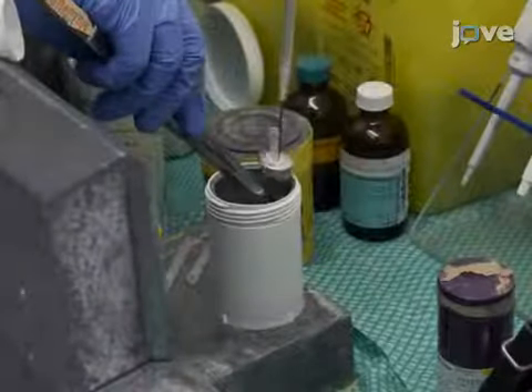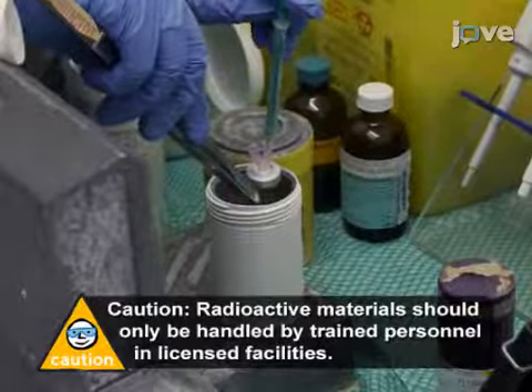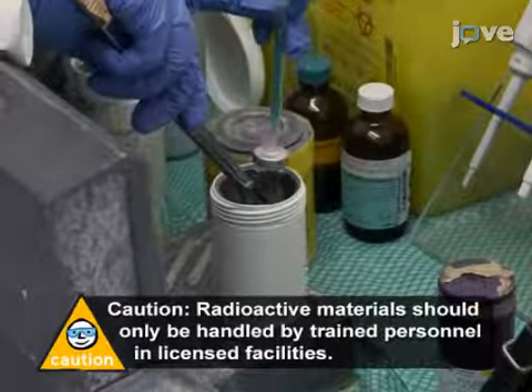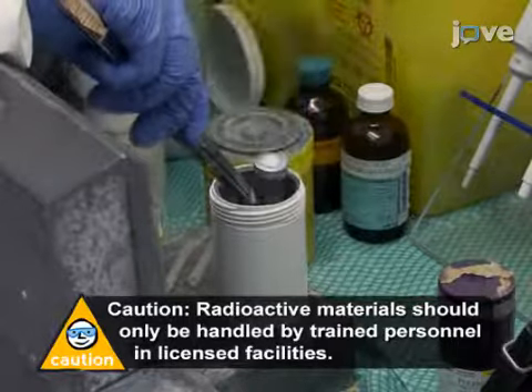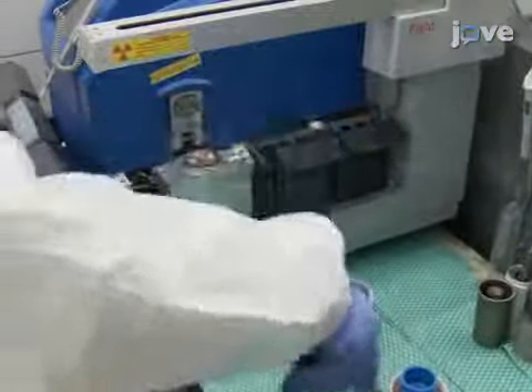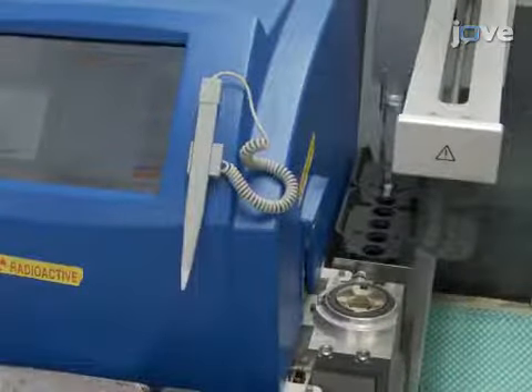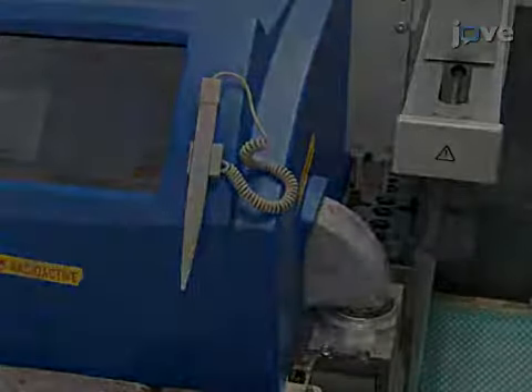Then add 4 mL of technetium-99m-pertechnetate in 0.9% saline, with an activity of 1,110 MBq to the vial. Load the reaction mixture into a microwave reactor and stir for 10 seconds. Then heat the mixture at 110 degrees Celsius for 3.5 minutes.